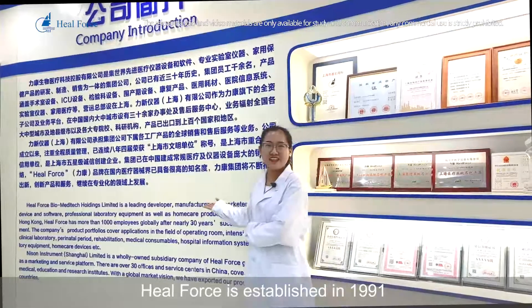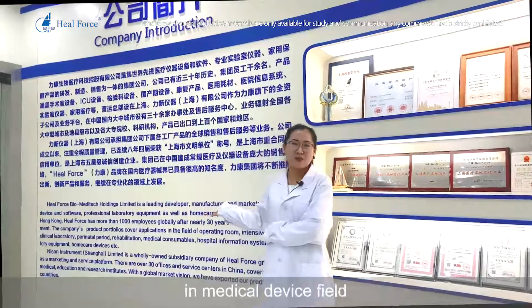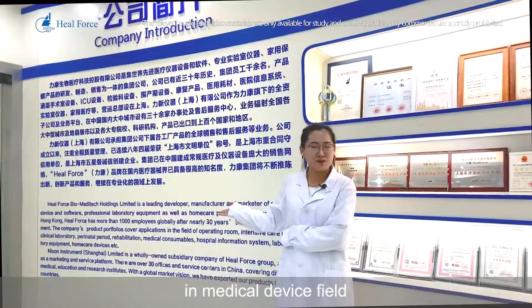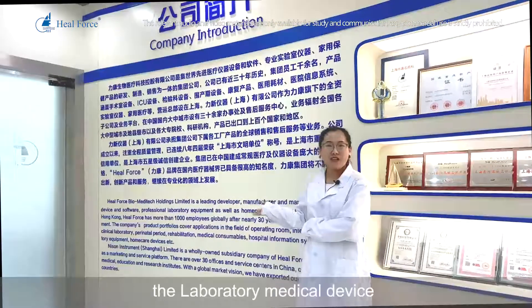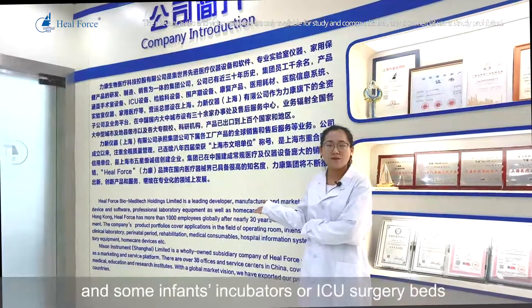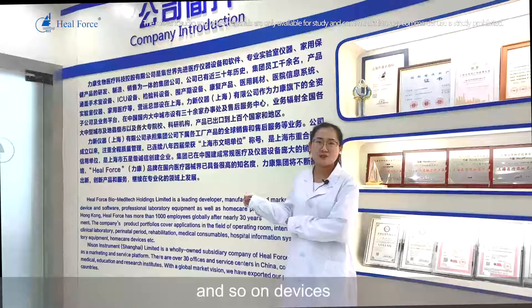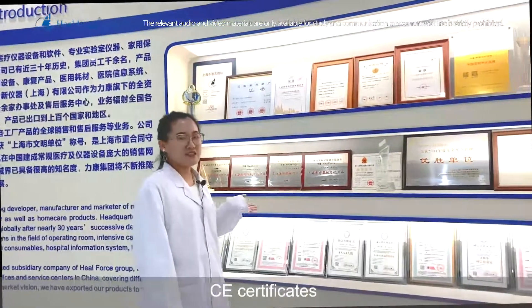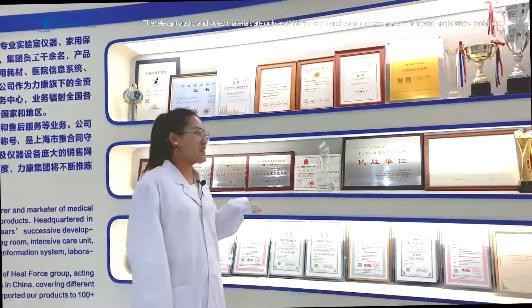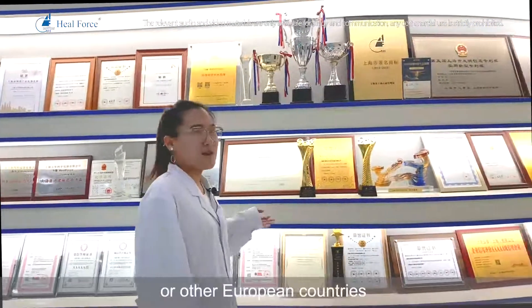HealForce was established in 1991. It's a company with more than 30 years of experience in the medical device field. Our main products include laboratory medical devices, surgery medical devices, infant incubators, ICU surgery beds, and more. We hold certifications including CE, FDA, and other certificates required by American, European, and other countries.